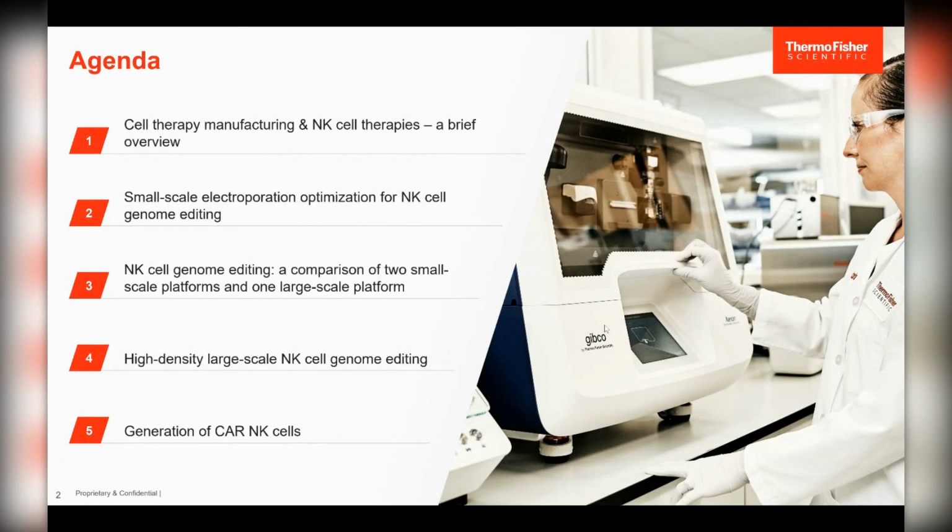Overall, today's agenda will be an overview of cell therapy manufacturing and NK cell therapy, small-scale electroporation optimization for NK cell genome editing, a comparison of two small-scale platforms and one large-scale platform, high-density large-scale NK cell genome editing, and the last part will be generation of CAR cells and testing of the functionality of those CAR cells.